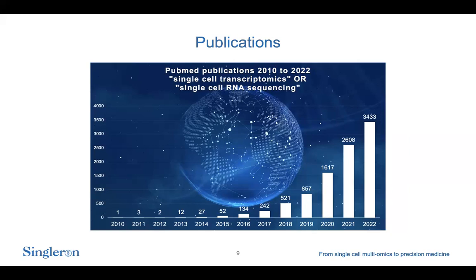So it might well be that in a couple of years, single-cell sequencing will become a ubiquitously present method that can be utilized in any lab capable of producing NGS libraries.